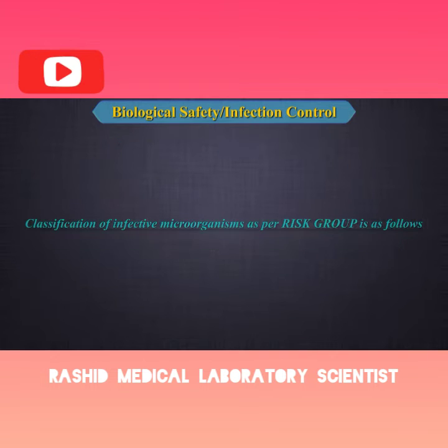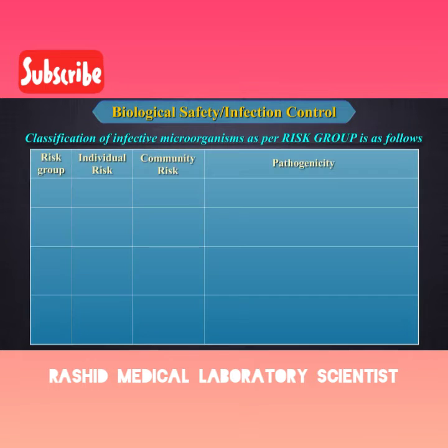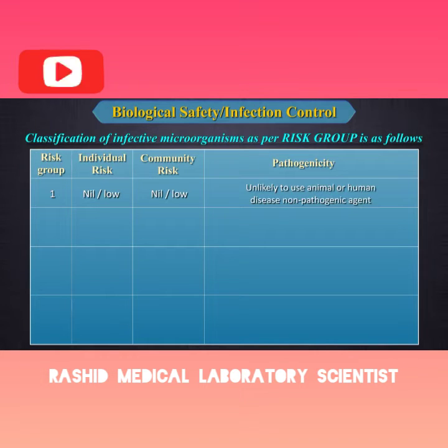How do we classify infective microorganisms as per the risk group? This is how it is done, as we can see in the table. A risk group 1 is where the individual risk is nil or very low, and the community risk is also nil to low. The pathogenicity here is that it's unlikely to cause animal or human disease, or otherwise you can call it a non-pathogenic agent.